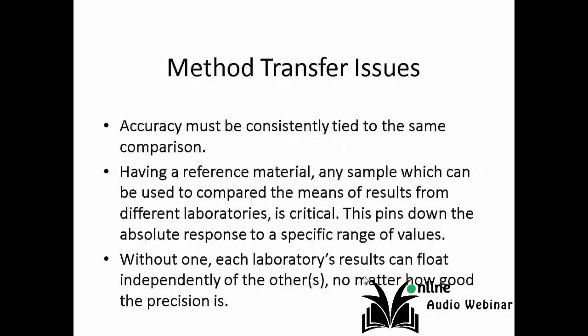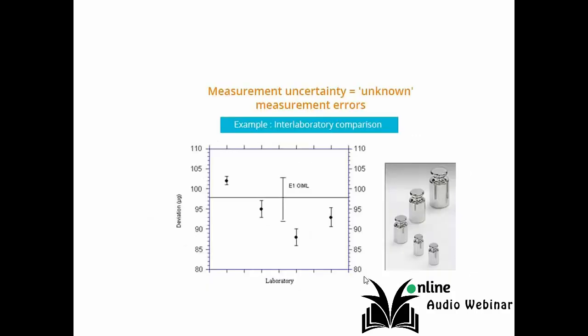Transfer of methods, which I'll go through quickly. Everything must be the same to have perfect transfer. This is just a little illustration to why that is important. It comes from a National Institute of Standards and Technology publication.